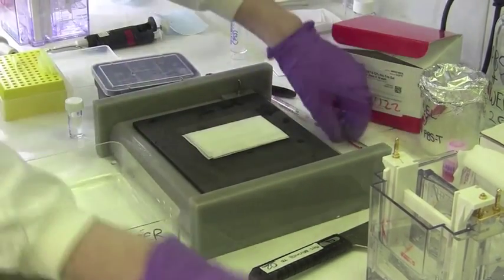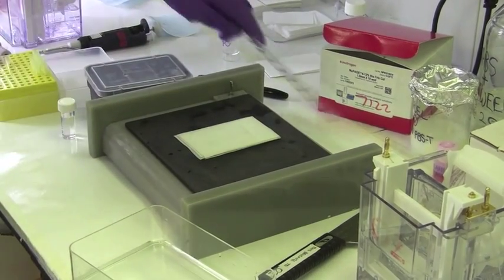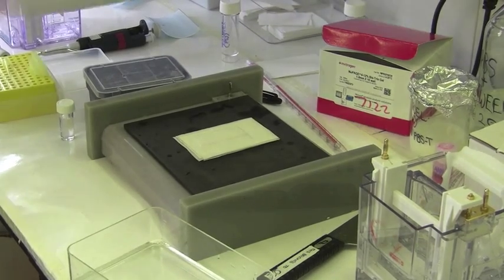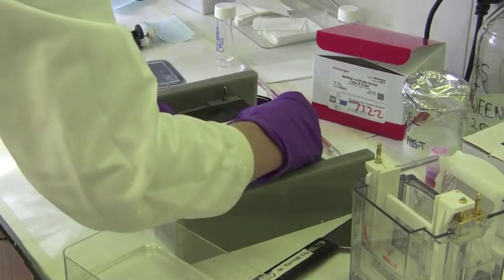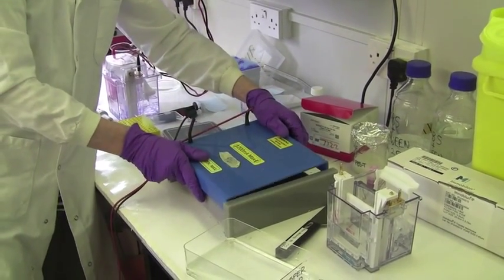It is essential no air bubbles are present between each layer of the membrane or gel sandwich. Before the addition of the cathode, a final layer of pre-soaked filter paper is added. The whole package is then clamped together.